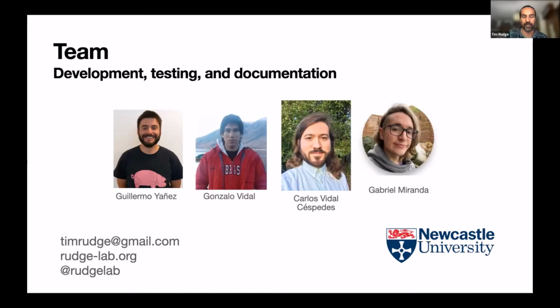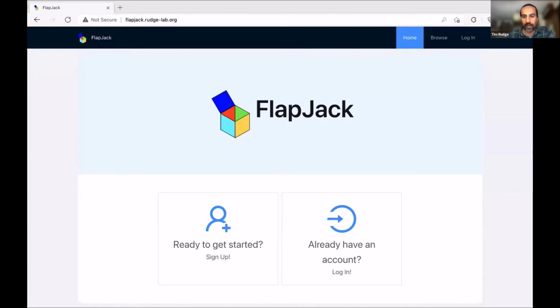So I'll hand over to Carlos, who's going to start the workshop with a description of the front-end interface and how to work with that. So stop sharing. Okay. Thank you, Tim, for the introduction. So are you able to see my screen? Great, I'm here on Flapjack.